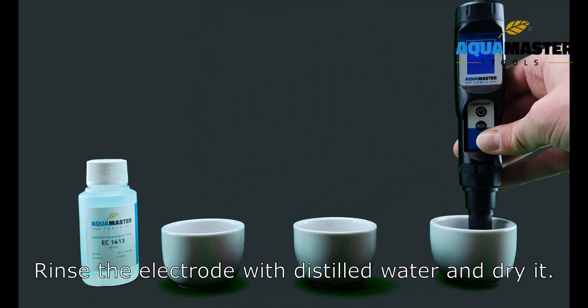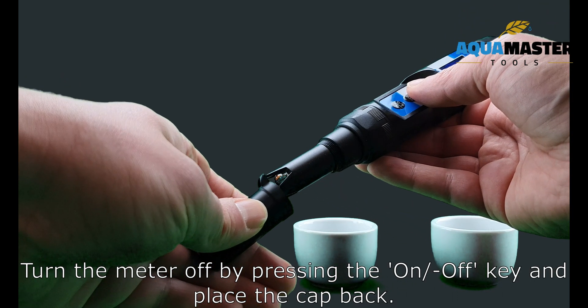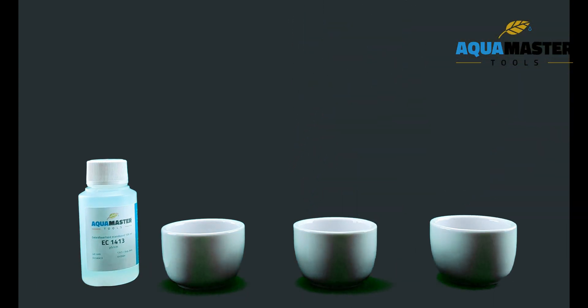Rinse the electrode with distilled water and dry it. Turn the meter off by pressing the ON-OFF key.